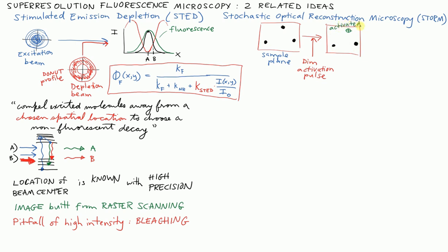And what I mean by that, and I'll explain it more below, is that that location has gone from being unable to be excited by the blue light to fluoresce to being in a state where it can be excited by blue light, it can be absorbed and then can give off a fluorescent photon. So two of these molecules are simply in what we call a dark state, unable to absorb an excitation photon, but one of them is able to.